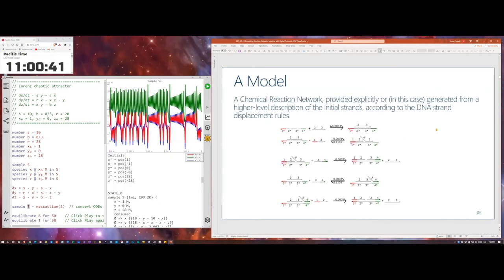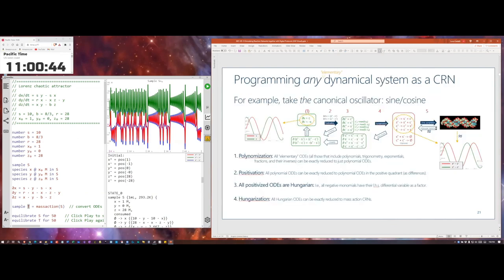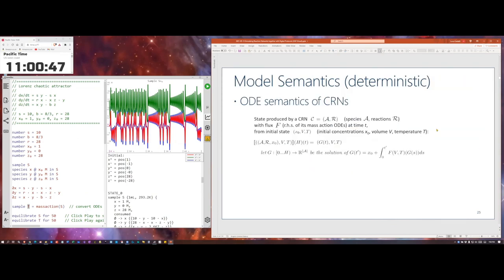Yeah, that's a very practical problem. So I've tried to incorporate some of that. I have a couple of additional operations. Evaporation is a problem, especially in digital microfluidics, and you may want to have a way of modeling that. So you may want to add some operations that incorporate that. Basically, there is an operation that allows you to brutally change the volume of a sample, and an operation that allows you to change the temperature of a sample. And so you can interject those into your protocol, and you can make them parameters, and maybe you can try to infer what those evaporation parameters are. But there is no easy solution, I think, because it's also very much hardware dependent.